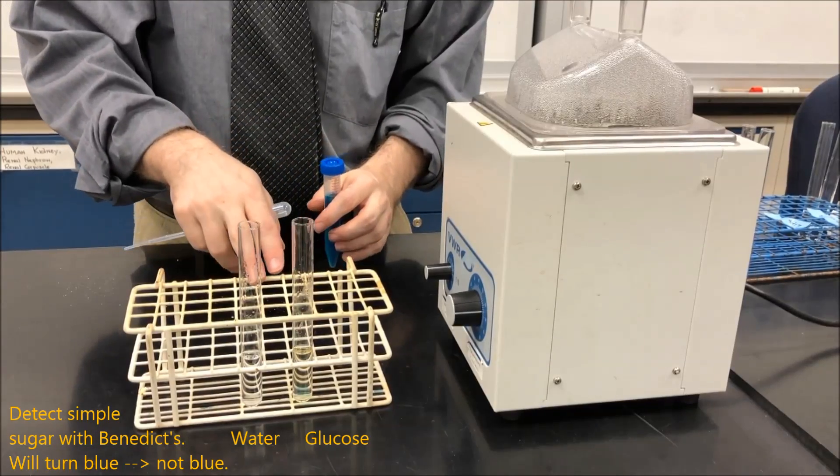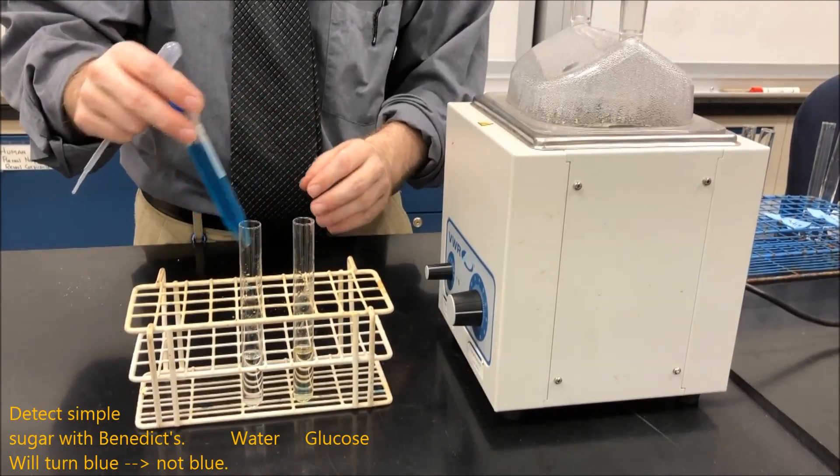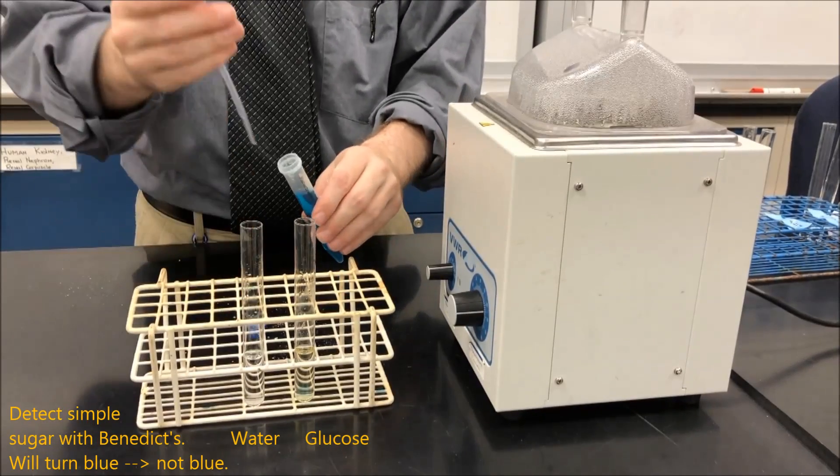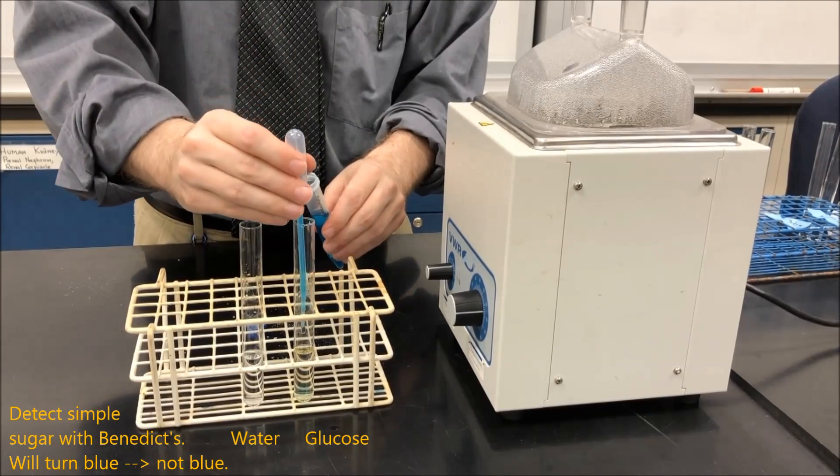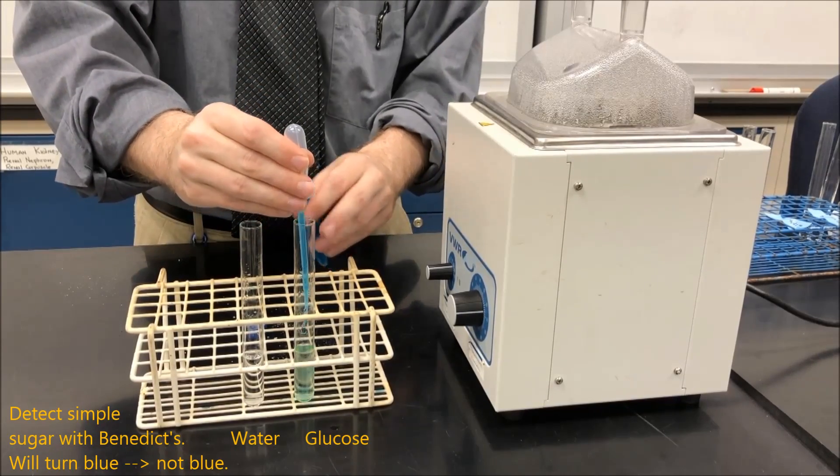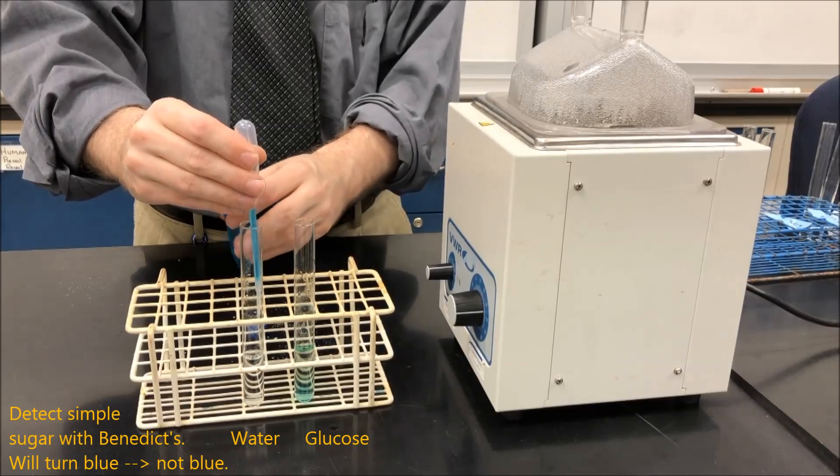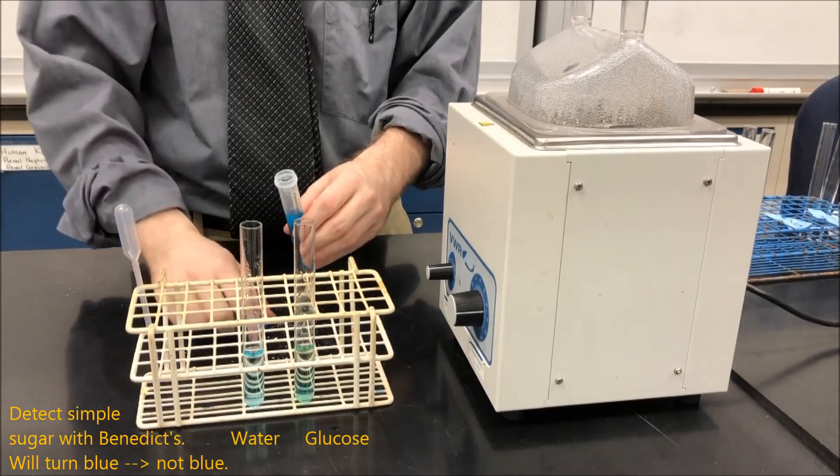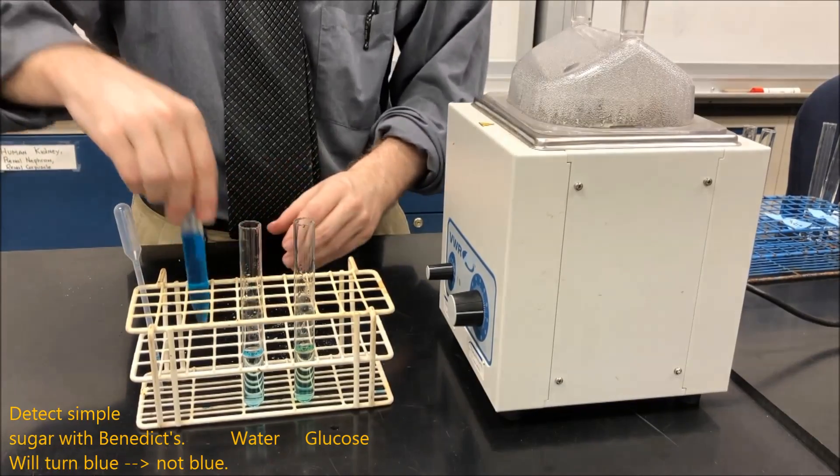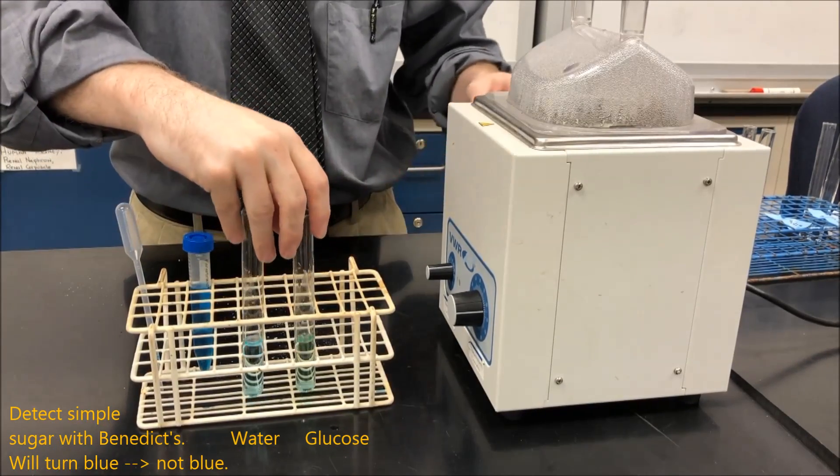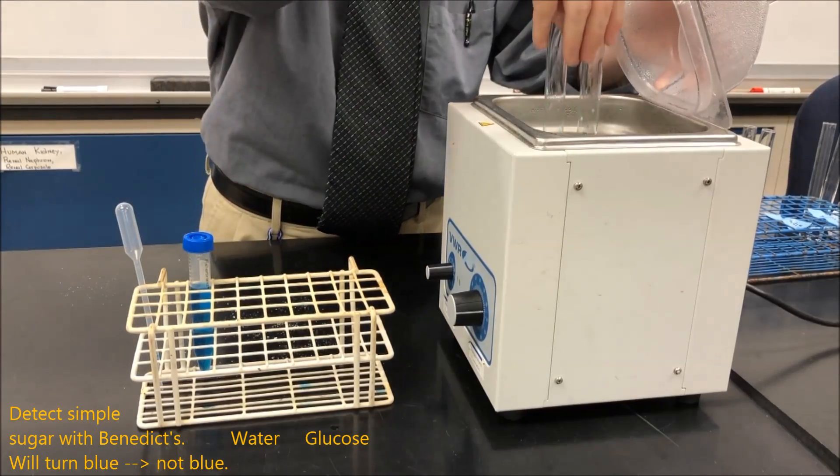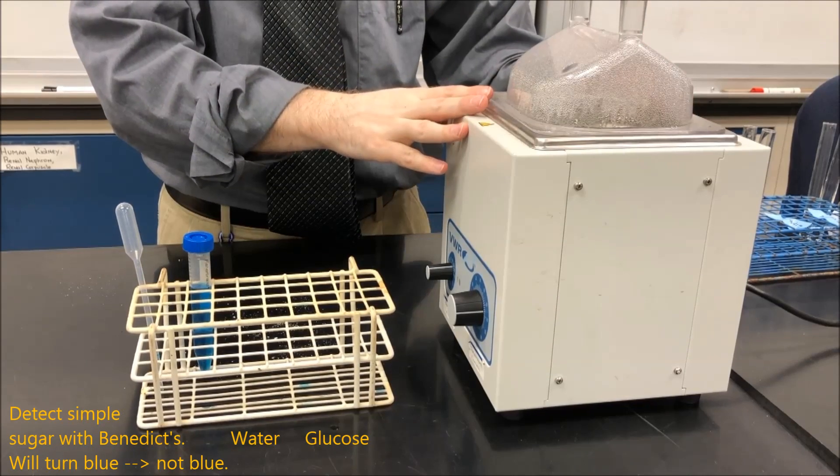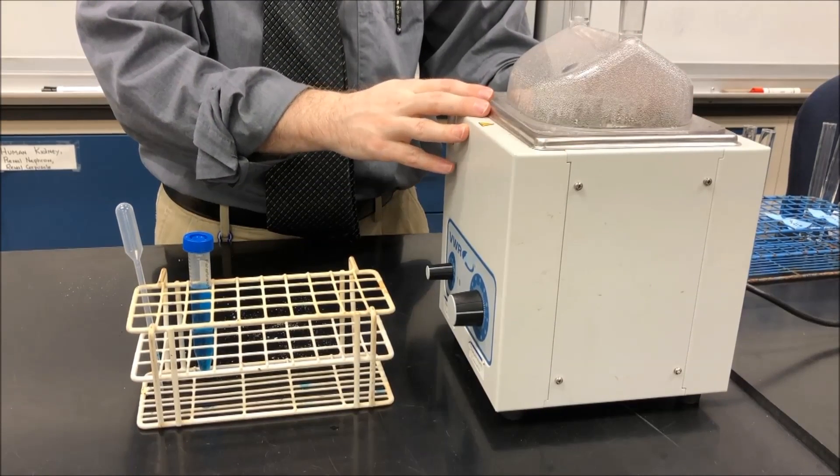To detect simple sugars, we can use Benedict's reagent. So notice Benedict's is blue in color. Going to add some to some glucose I have here, and as my control, to some water. Now Benedict's needs a few minutes to heat up. So I'm going to take my two test tubes and I'm going to put them in the water bath. And then about three to five minutes, we'll take them out and then look to see what color they've changed.